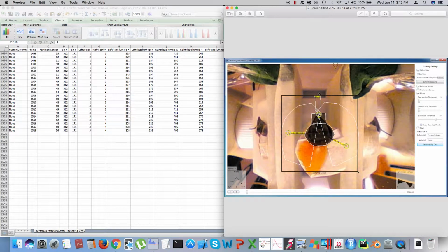These sectors are basically 36 degrees wide each. This measure will tell you, from these yellow points, which is the antenna that the software is likely detecting, or believes or thinks is the antenna, the sector that has the most of these points.